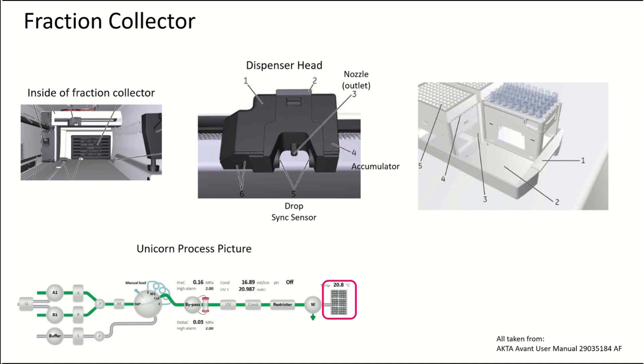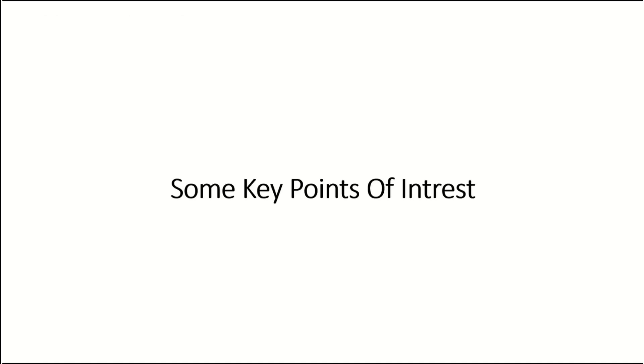Alright, so that's a simple rundown of the flow path. However, I'd like to show you some key points of interest in the flow path, so we're gonna start over again.